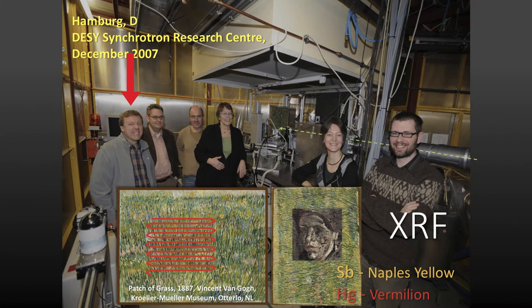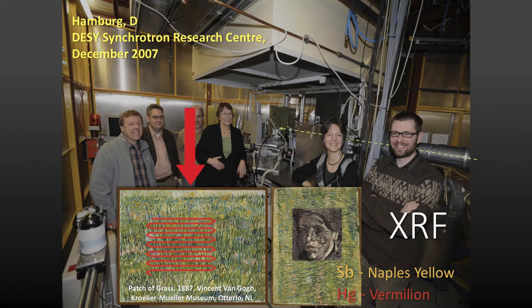And well, you see myself here as a version of 10 years ago, a little bit younger. But we're all very happy because this is our last experiment of the year. It was a kind of Christmas experiment, and the experiment was fairly successful. And what we were trying to do was to examine a small painting you see here behind us in this large machine. So what we were looking at, a small Van Gogh painting like this. And we managed to convince this lady, who is a museum curator, to come and bring her painting to the synchrotron, which is not so easy to do. You cannot just take a Van Gogh and put it in your briefcase and go somewhere. It requires guards and insurances and a truck and blah, blah, blah.